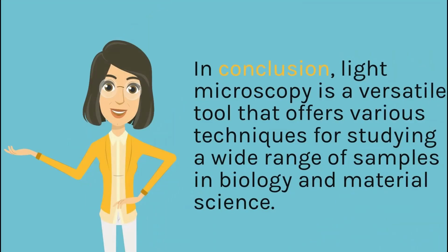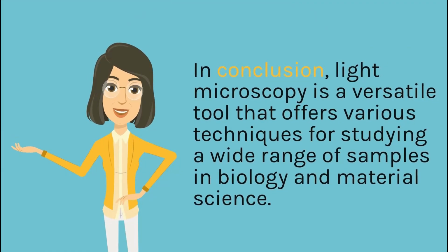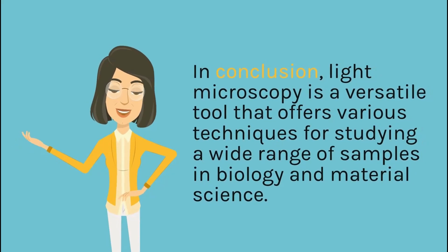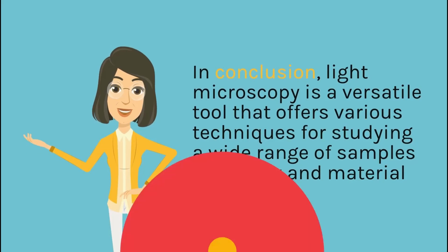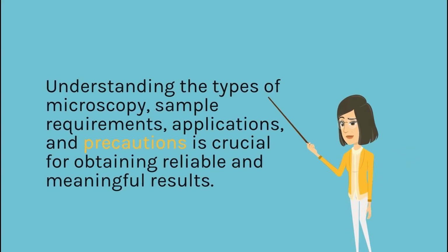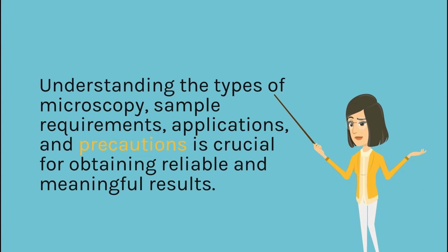In conclusion, light microscopy is a versatile tool that offers various techniques for studying a wide range of samples in biology and material science. Understanding the types of microscopy, sample requirements, applications, and precautions is crucial for obtaining reliable and meaningful results.